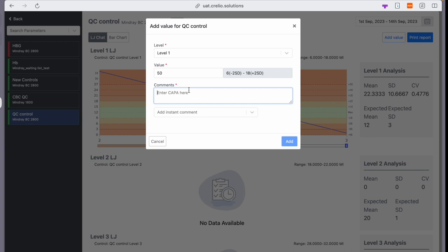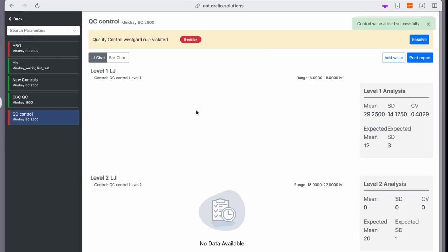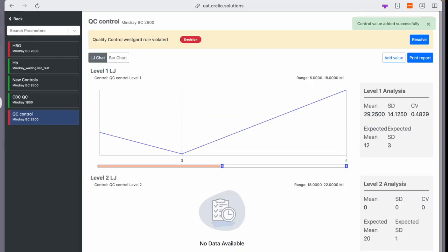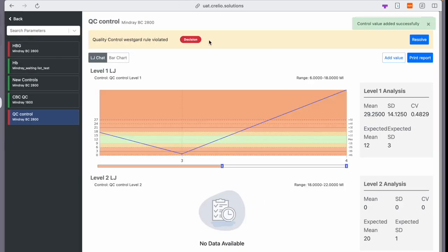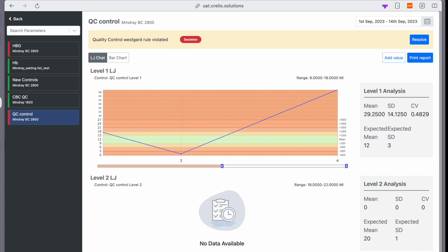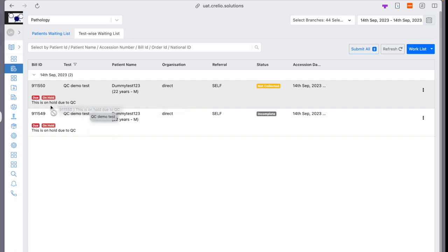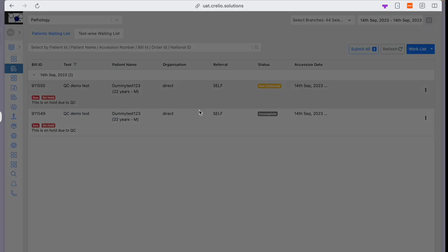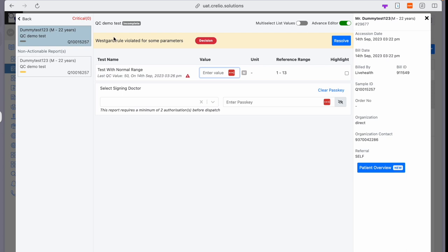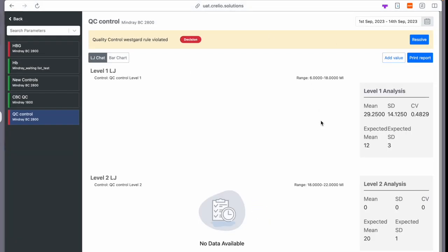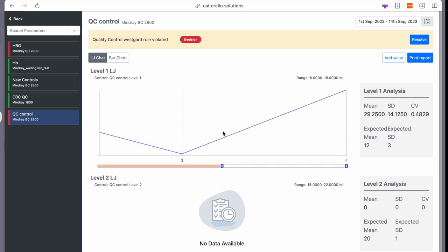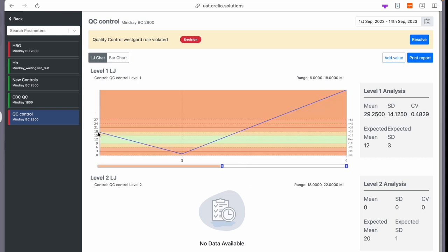Westgard rule that causes a decision. So if I add the value now, I see that the Westgard rule is violated, going into decision mode. If I go to the waiting list, I see that the reports which are mapped to this control are on hold because of QC. And if I open the test, I see that the Westgard rule is violated and it goes into decision mode. If I click on resolve, it takes me back to the QC module where I have to mark this as resolved.